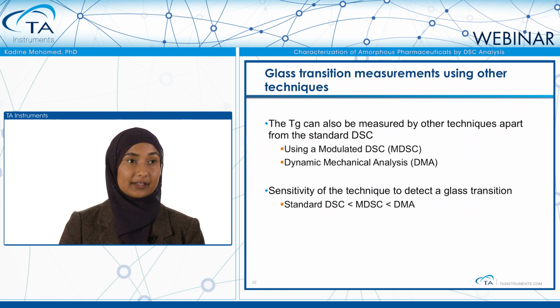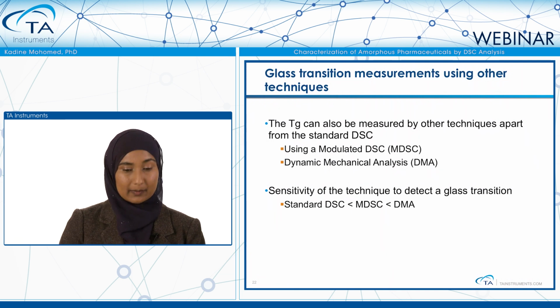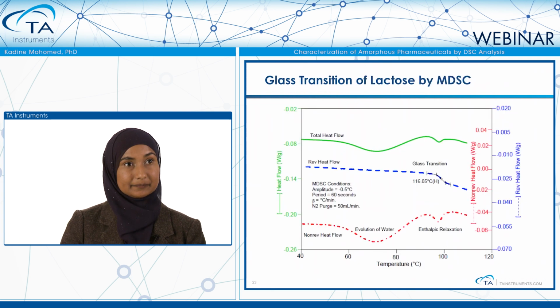Absolutely. Using the powdered preparation or powdered clamp accessory on the 3-point bend dual cantilever on the DMA, you can certainly perform temperature ramps and determine the tan delta peak associated with the Tg. But what we're going to look at for this presentation is a focus on modulated DSC.